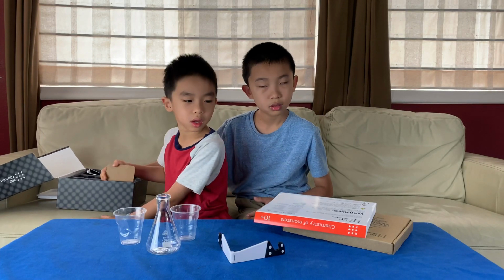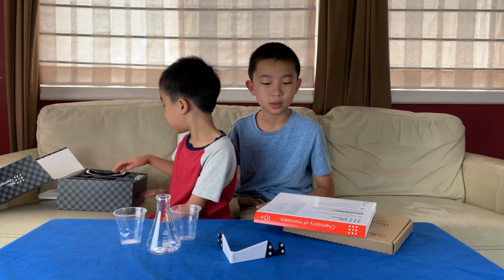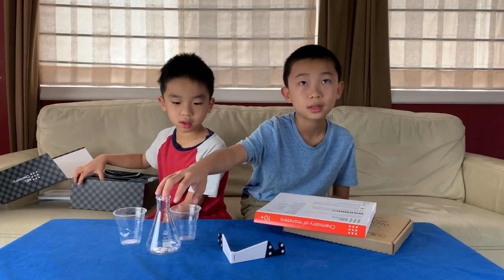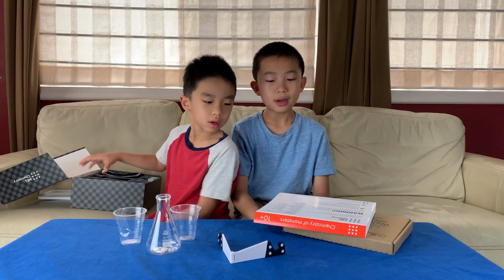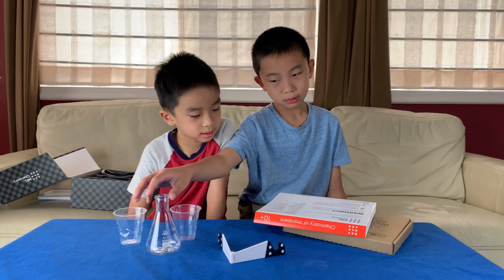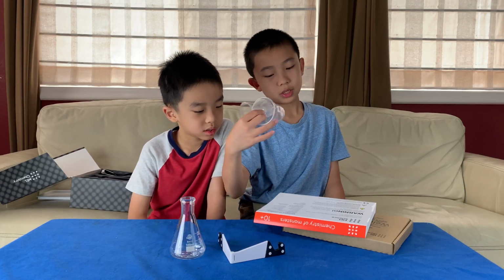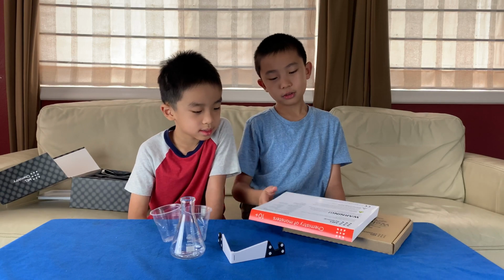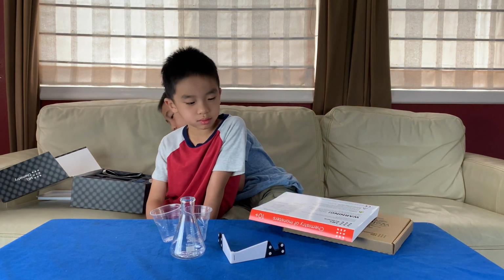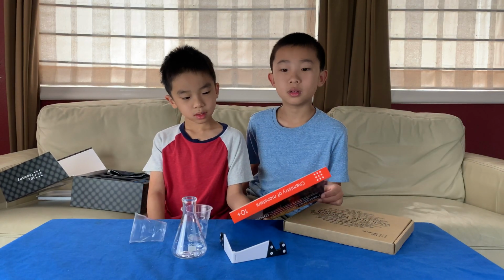Oh, real quick, tell the camera what you're doing. Right now we're collecting everything that we need from the starter kit. So we already got. No, for the project. Oh yeah. Right now we're collecting everything we need for the project from the starter kit. So we already got the flask, 2 disposable cups, and now we're trying to find the flame diffuser. Oh, you didn't mention what project you're making. Oh yeah. The foam snake, right? Or whatever.